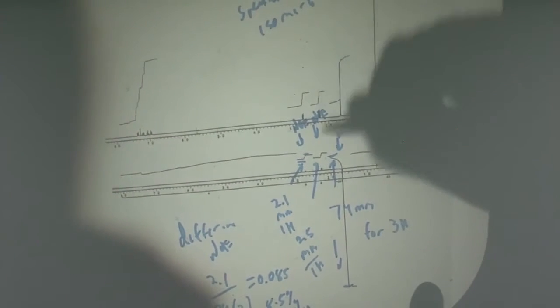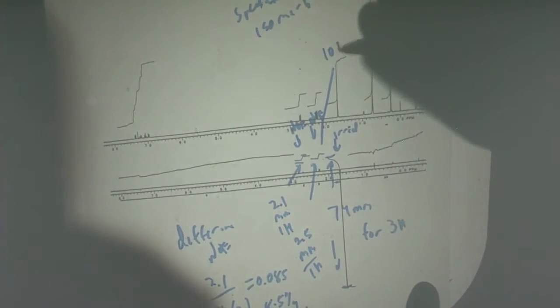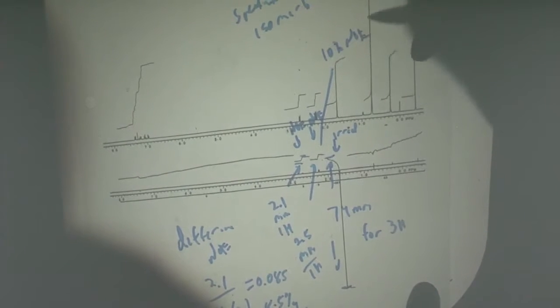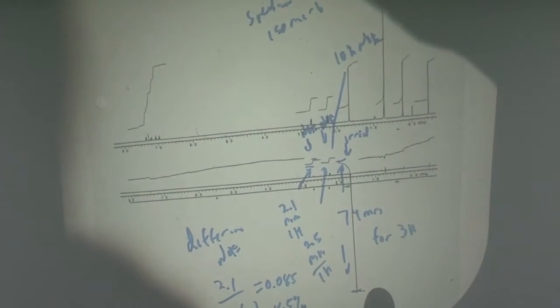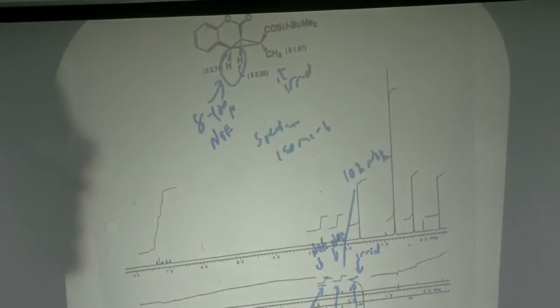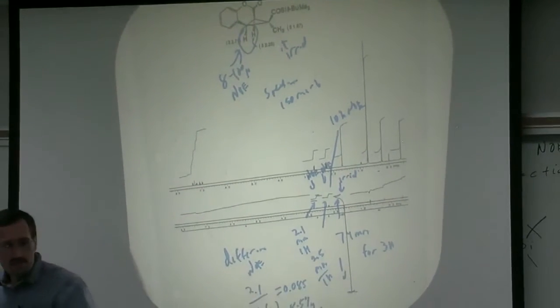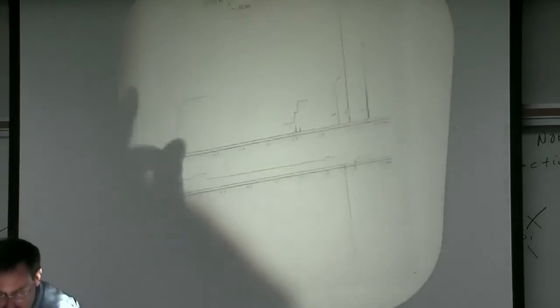And if I do the same over here, I find that now I have about a 10% NOE. And so I'm very happy. I irradiate, get about an 8 to 10% NOE, and I say, great, we know what diastereomer A, diastereomer B is. Now, you want to be careful. So you do this same experiment, and I was fortunate, we have both diastereomers. You do the same experiment here.